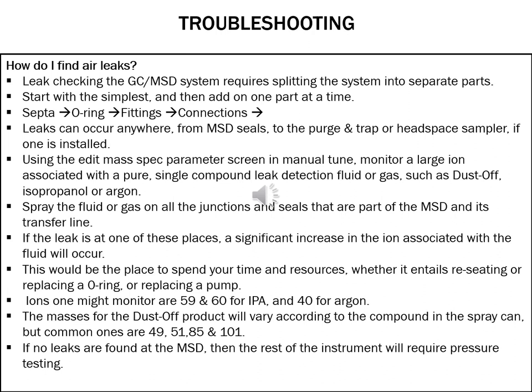And then if you've checked and you still can't find the air leak, then maybe the ferrule on the transfer line is cracked and needs to be replaced. Maybe you might find that there's a leak coming from the side of your MSD, and the O-ring on the side of the MSD needs to be replaced, or maybe your vent valve is open, or the O-ring on the vent valve needs to be replaced. So you can go through all the slides, and they're self-explanatory. If you've got questions, you're more than welcome to drop me an email, and I will answer all those questions via email.